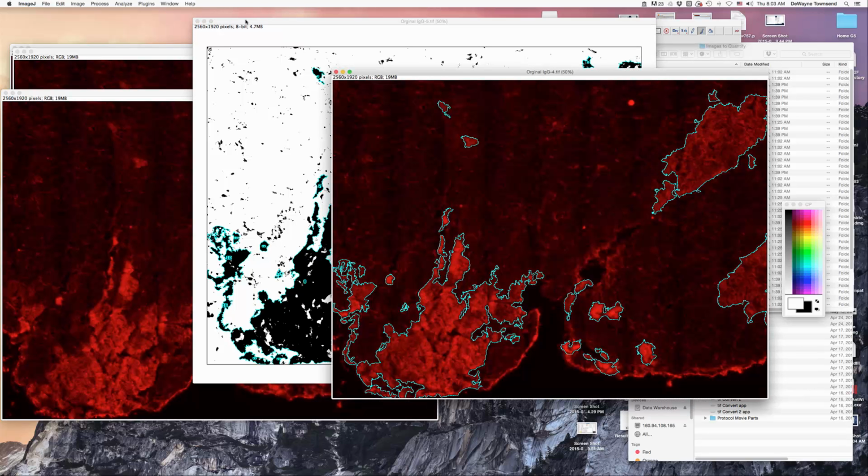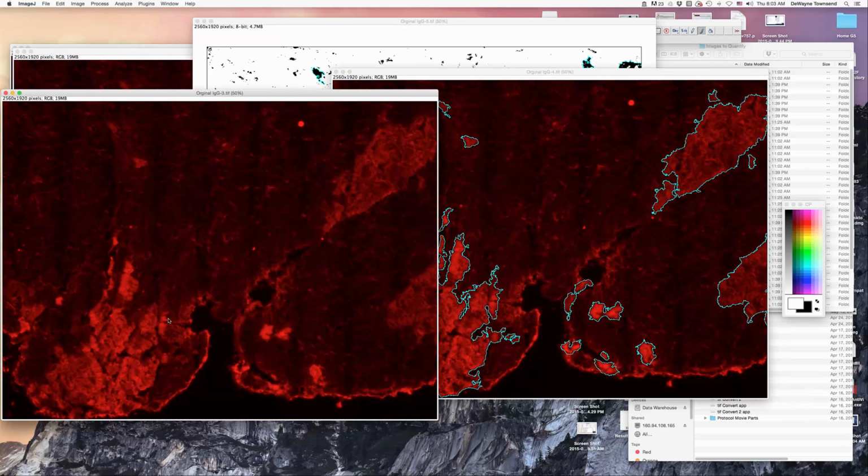Okay, come back here, overlay from our, okay. Alright, so you can see we sort of scaled that back a little bit, which I think is appropriate. We sort of stop at this area here.